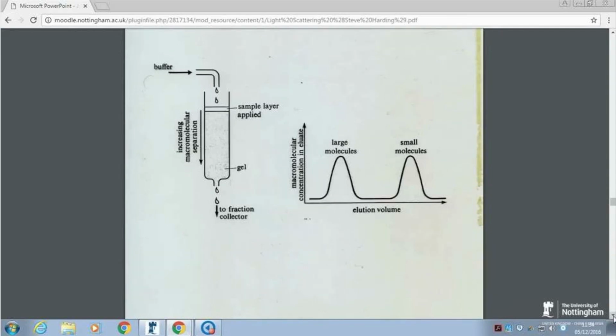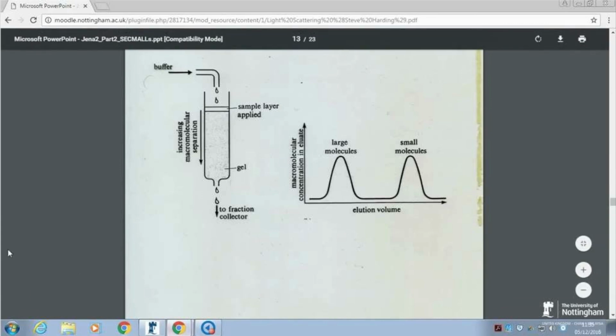What activity is happening here? Chromatography. Yeah, column chromatography. The guy called it gel permeation chromatography or size exclusion chromatography. As you see, it's the same thing really, because it's molecular sieving, or gel exclusion. So this is what the guys were on about.